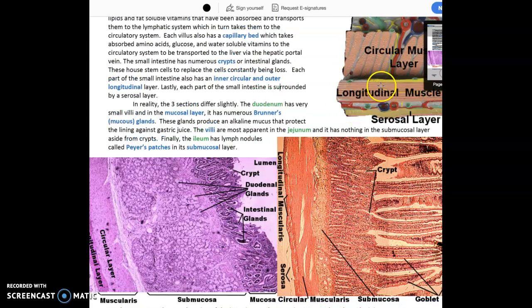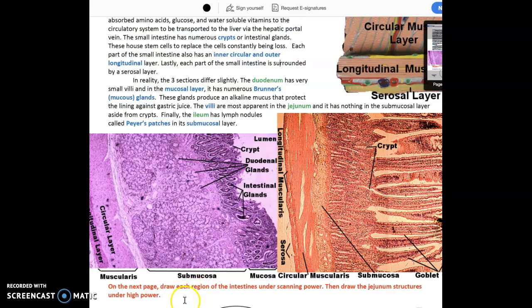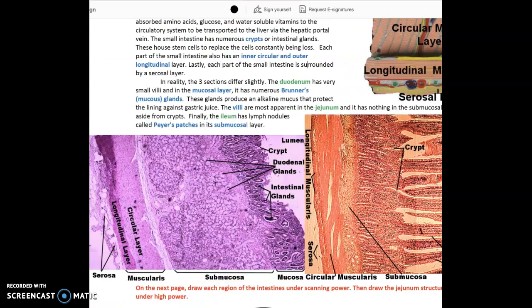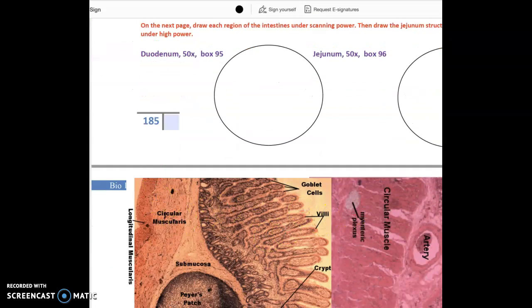Then this other part is the longitudinal muscularis right here. So this is longitudinal. This is longitudinal. I have to move this over a little bit. That's longitudinal. And these are running north, south, up and down your intestines.